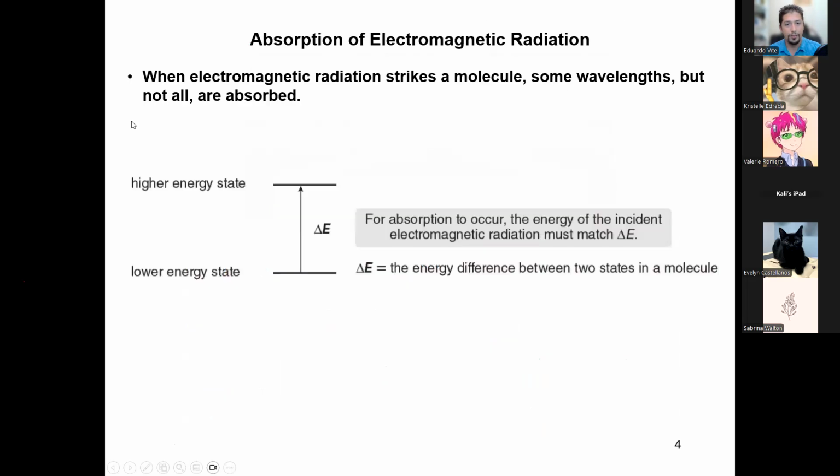Okay, I'm going to move on to the next slide. So what do I mean by interacting? I'm telling you we're shooting a photon of a certain energy at matter or an atom or a molecule. What exactly do I mean by resonate? It absorbs the energy, it resonates with the molecule.